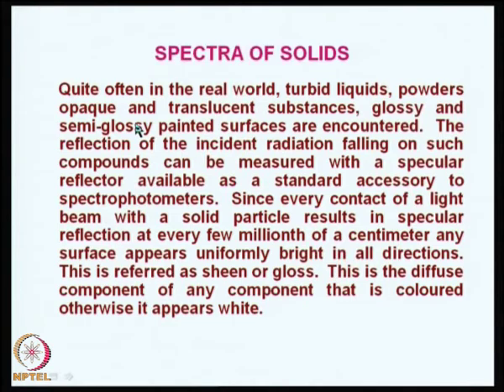And then another aspect that is very useful in the determination of substances using spectrophotometry or accessories. Now, that is the spectra of solids. Quite often we are unable to take the spectrum because it is a solid. If it is a liquid, a very clear solution, there is no problem, we can always take it to the spectrophotometer and measure the absorbance. Sometimes if it is a precipitate, yes, still we can do it by adding protective colloids and take it to the spectrophotometer and make our measurements.